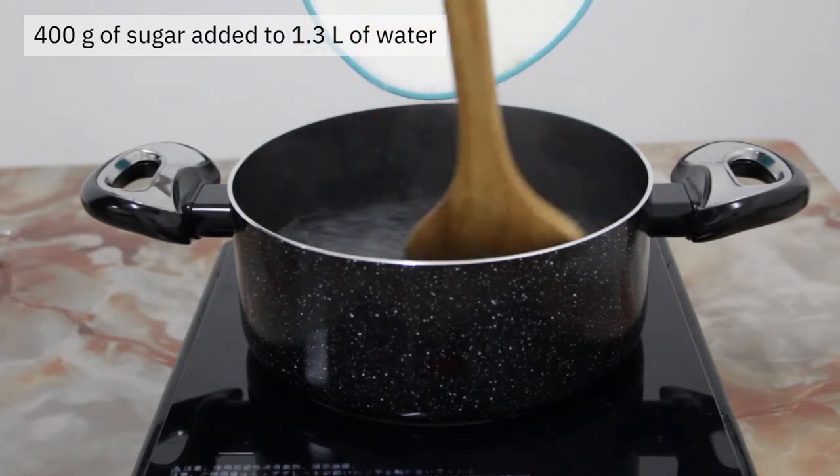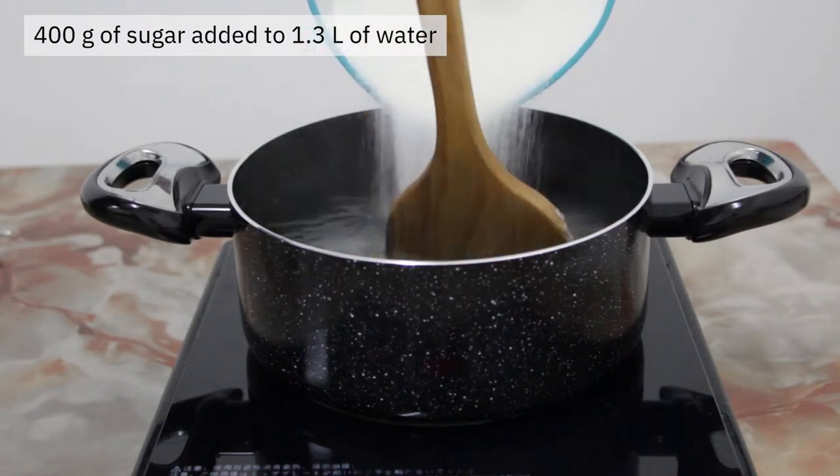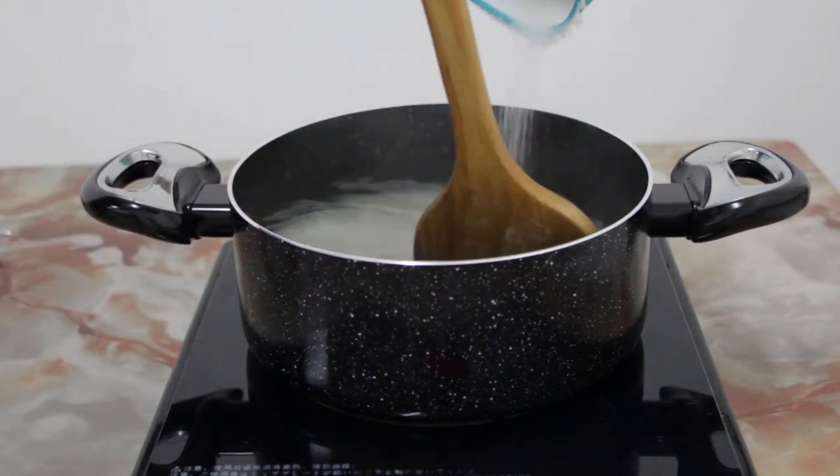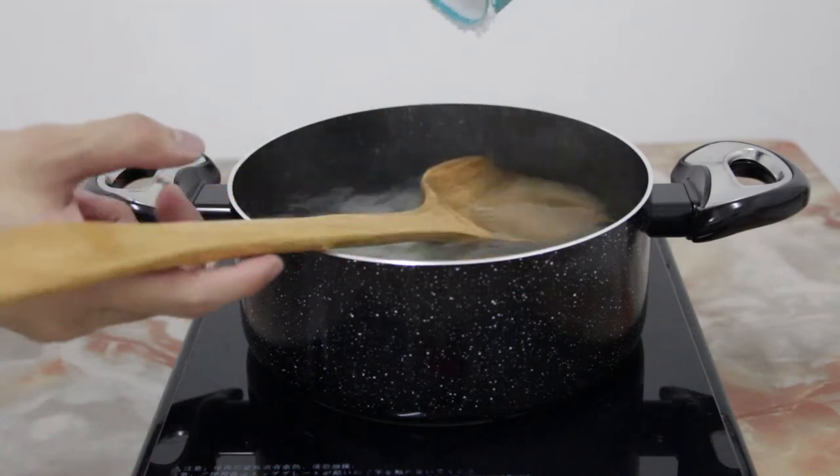First, 400 grams of white sugar is weighed out and poured slowly into a boiling pot of roughly 1.3 liters of water. The content of the cooking pot is stirred slowly until the sugar dissolves completely.